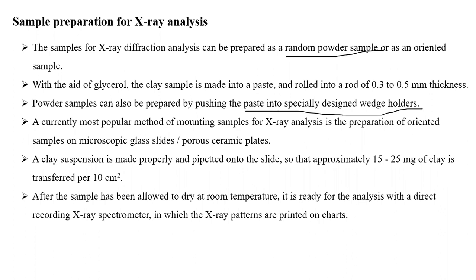Currently, the most popular method of mounting an X-ray sample is by orienting it on small microscopic glass slides. Now we are using microscopic glass slides, or porous ceramic plates have been used. We use glycerol. Why? Because it avoids some problems with water molecules. Sometimes, as I said, for saturation we can saturate the sample with potassium and magnesium ions also. Another one is a clay suspension, made properly and pipetted onto the slide.